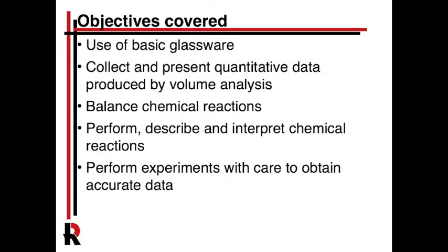This lab is pretty complicated, but it does have just a few basic objectives that are covered. Mainly, it's a quantitative lab with some sophisticated glassware, and you're still doing a chemical reaction. Enzymes are very important catalysts involved in a lot of chemical and especially biochemical processes. They are basically the fundamental basis for biochemistry and for life. We're not really going to go into enzymes too much in this one, but being able to run those is a good example.